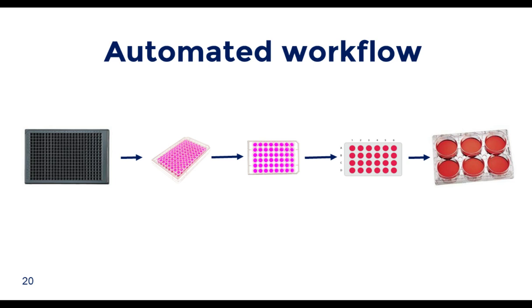Now that we have our automated workflow planned, it has to be tested with an actual representative cell line development campaign. Pipetting methods can then be optimized with truly representative cultures exhibiting representative cell number, positioning, and adherence. This also allows the actual culture time required in each new plate type to be evaluated. At each scale-up step, the decision to scale up can also be automated.